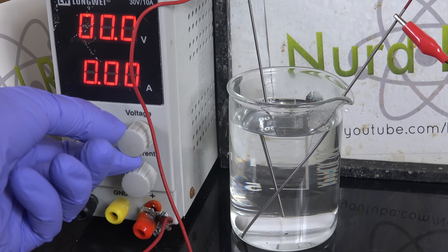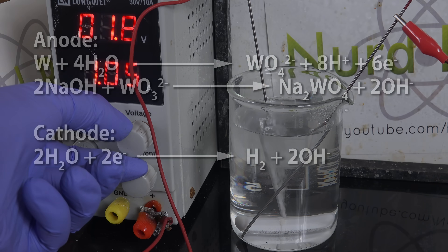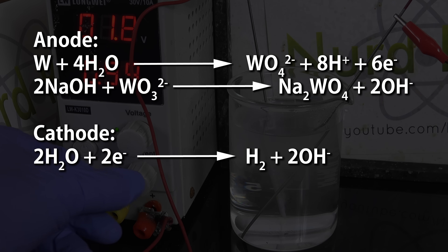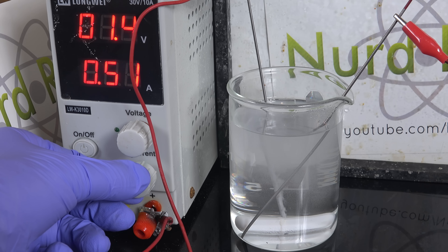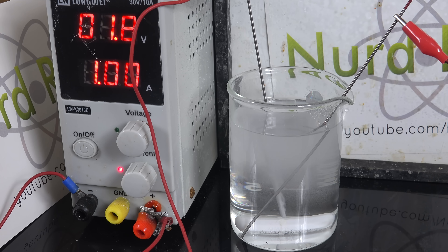Apply a constant current of about 1–2A and set a maximum voltage of about 6V. And there it goes. What's happening is the tungsten is being oxidized at the anode to tungstate ions. Because the electrolyte is sodium hydroxide, they react with the tungstate to produce sodium tungstate, which is soluble. At the cathode we're just electrolyzing water into hydrogen and more hydroxide. Meanwhile, the thorium dioxide added to the rods during manufacture just falls out. And that's how we extract our thorium from the thoriated tungsten rods — a rather simple process if you know the trick of using electrolysis.